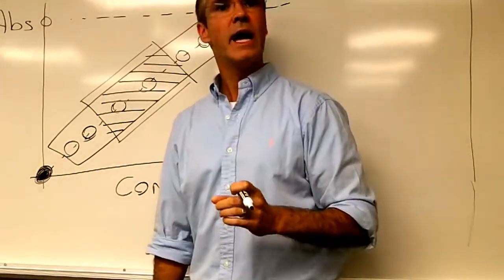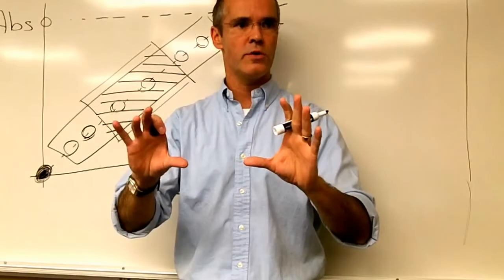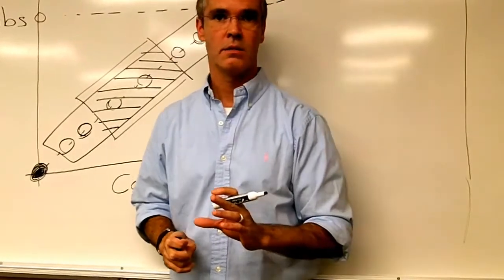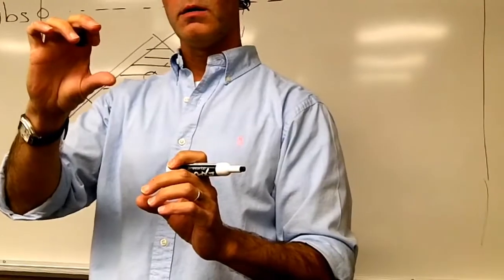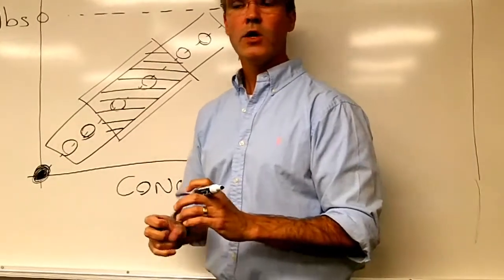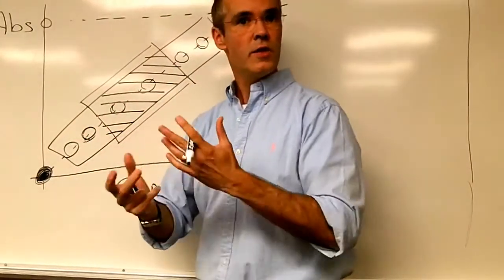What we would do in that case when you don't see that, did anybody forbid you to measure your standard before you do the curve? Did I tell you not to do that? No, I did not. You can measure your standard before you make your curve or your trend line. You can do that. So you can measure it, and then after that you produce this graph with concentrations.